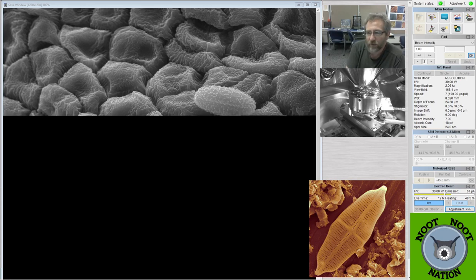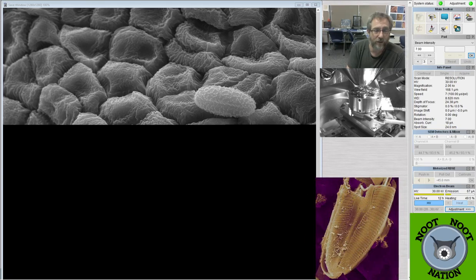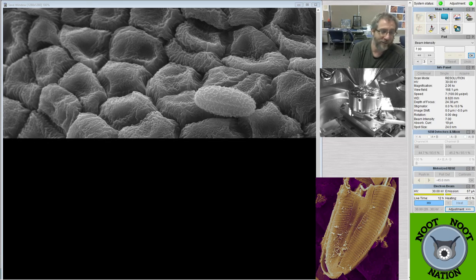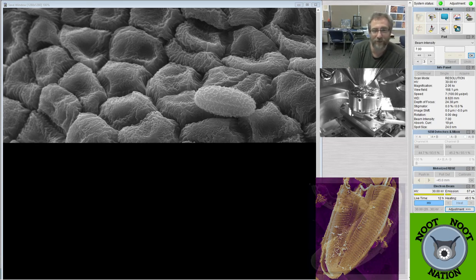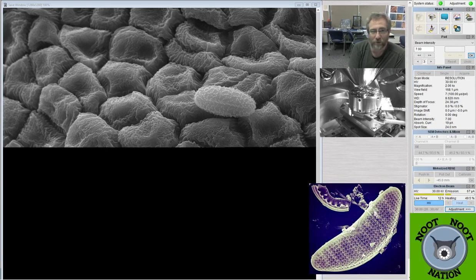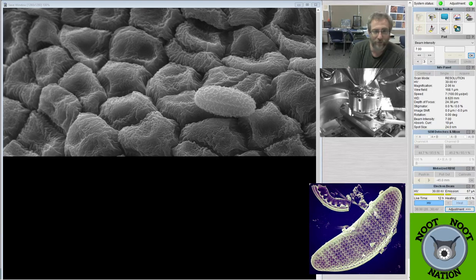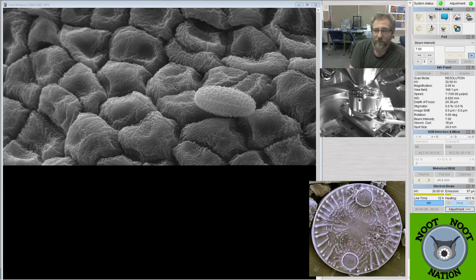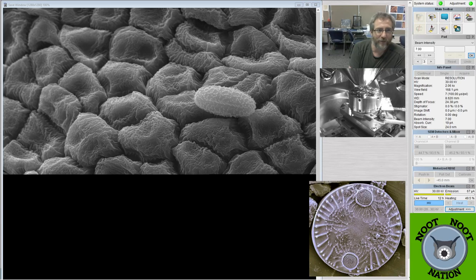Are you simply doing this pollen imaging for fun right now, or is there any specific thing you want to figure out? Right now, it's just for fun. I mostly analyze diatoms on the SEM. I figure people get kind of tired of every stream being diatoms, so occasionally I put some other things on there, just to look at them. It's pollen season, so I get interested in looking at different kinds of pollen. So this is just for fun. We're not actually trying to determine anything right now, but just looking at different kinds.